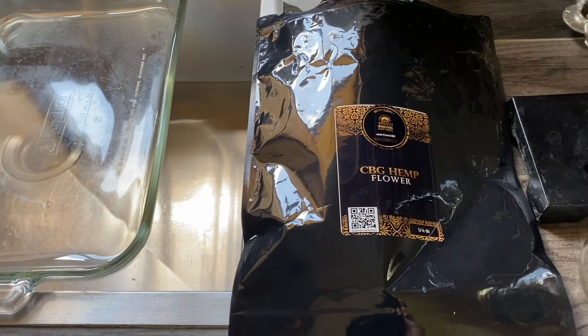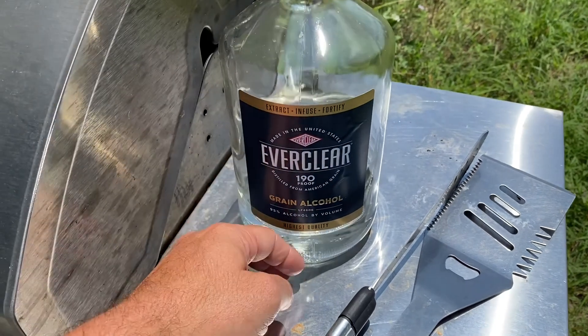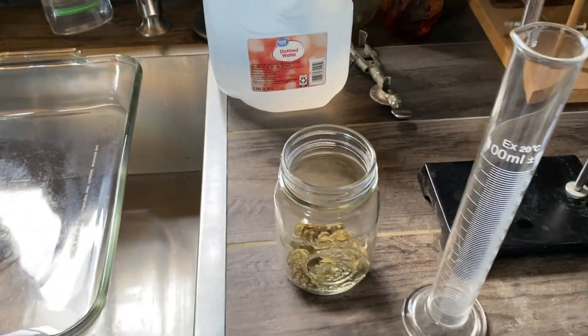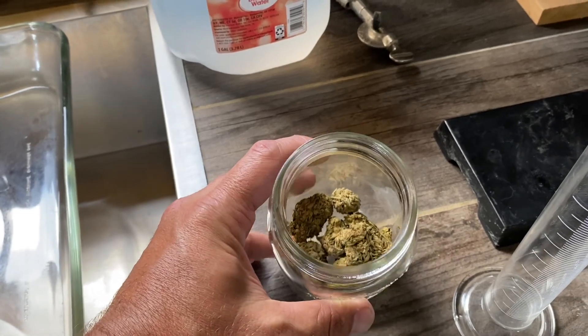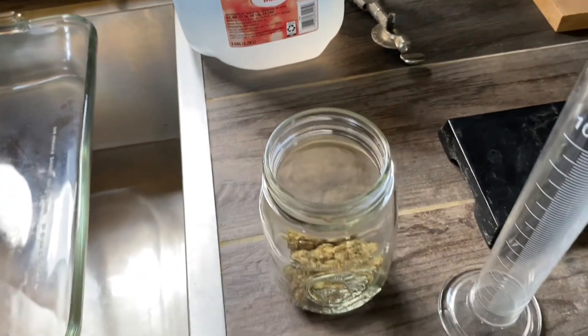And you'll need one last thing — good old fashioned Everclear. I like to get it a little bit warm, but not hot, just slightly warm out in the sun. So now we're going to take our mason jar, and we've added approximately five grams of very dry hemp flour from the strain that produces CBG.